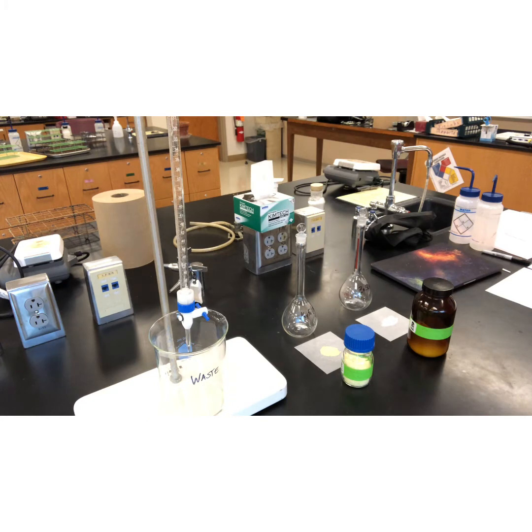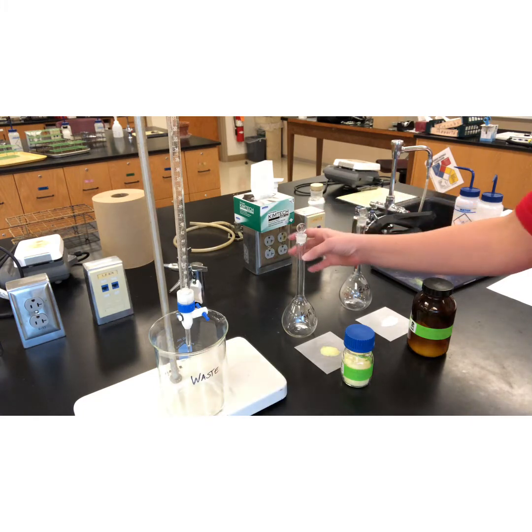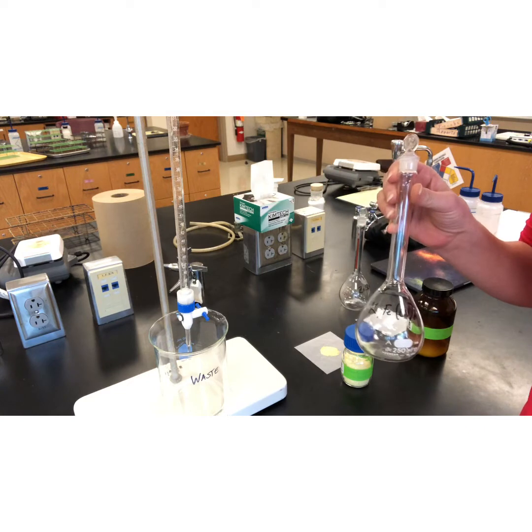So I took a mass that was roughly 2.6 grams, and then you can calculate the actual exact concentration from this mass and from the volume of our volumetric glassware. So our mass of the potassium ferrocyanide exactly is 2.6893 grams, and we are going to dilute that into a piece of what's called volumetric glassware.